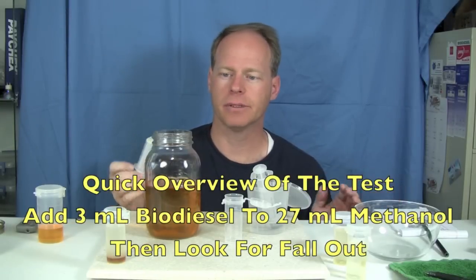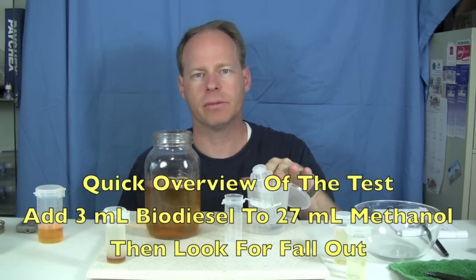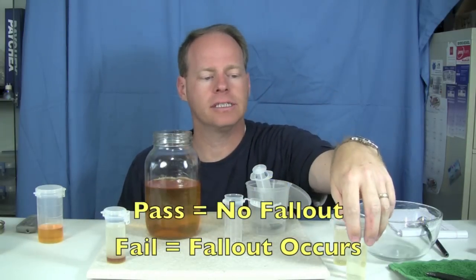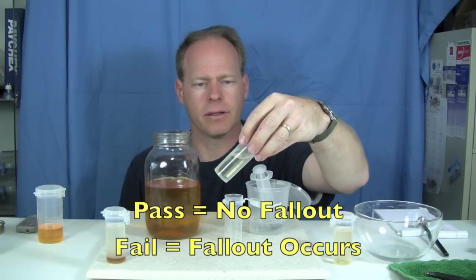To do the 3-2-7 test is real simple. We're going to take three milliliters of biodiesel that we want to test and 27 milliliters of methanol. We put it in this vial, we shake it a little bit, and then we look to see if there's any fallout. This is an example of a batch that had perfect reaction.